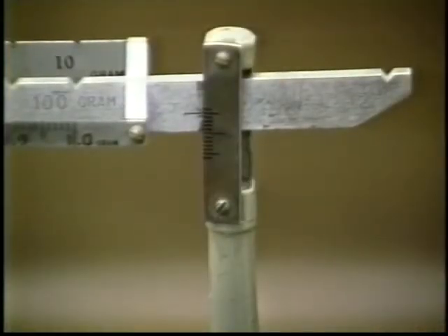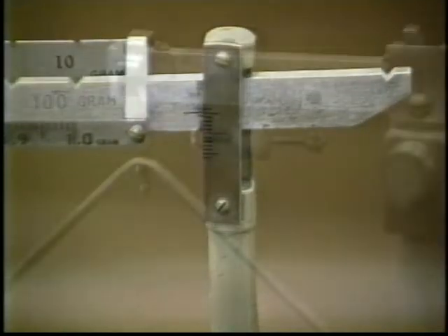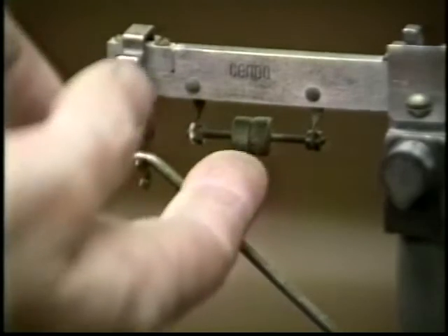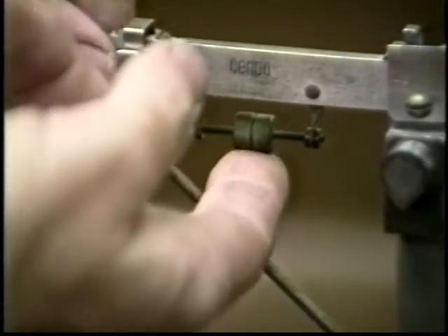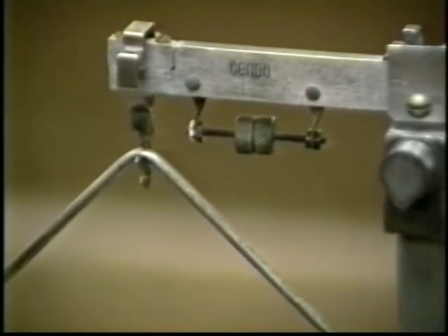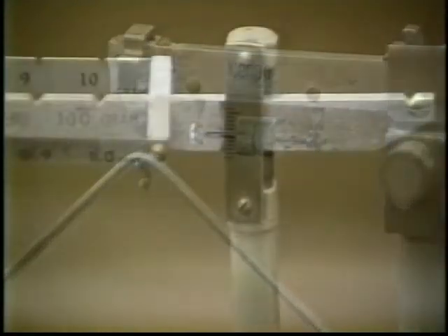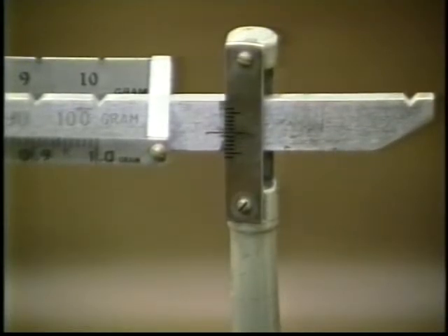The balance is not zeroed when the line on the beam is above the center line on the support. Adjust the zeroing screws to zero the balance — it might help to hold the beam while you are turning them. The balance is zeroed when the line on the beam lines up with the center line on the support.